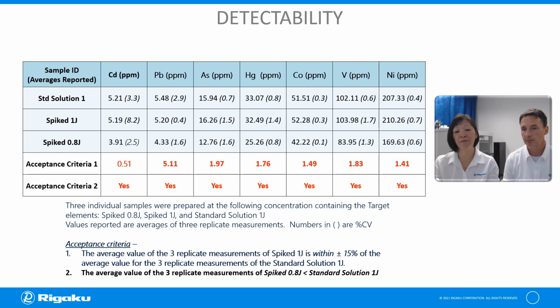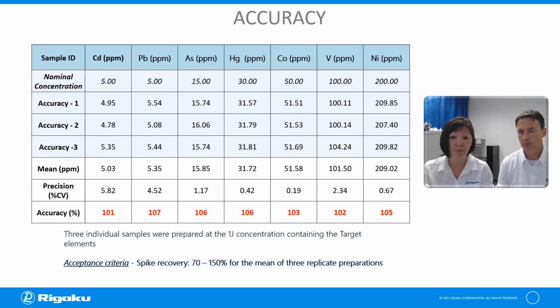Right. So I was in a GLP lab environment in my previous job, so following these guidelines was not as difficult. It's just a matter of creating the press pellet and spiking the levels and then just running this, and it meets the requirements really easily actually.